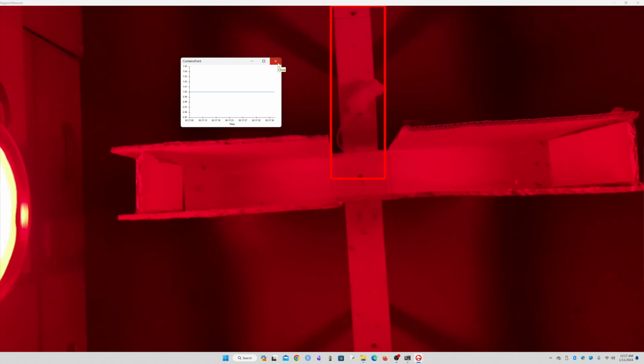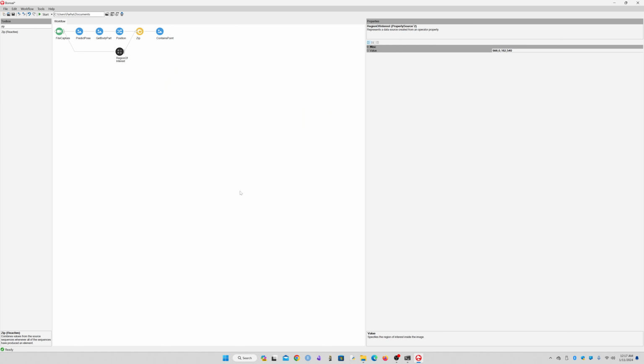So in this way we can further obtain information about when the mouse is entering or exiting certain regions of interest. And for the time being, you can see the scale over there at the bottom, red time. So that is how I'm keeping track of the amount of time the mouse is spending within certain regions, for example.